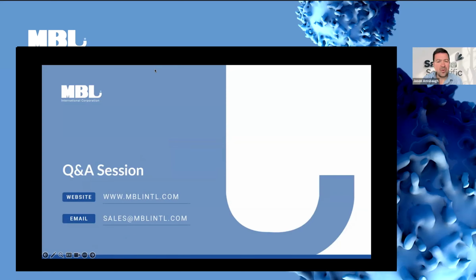Perfect. I've got one more question in the queue. Okay, audience members, if you guys have other questions, please ask them now. The question I have is, could this method be used to validate neoantigen in silico prediction tools? Absolutely. And for that, if all you care about is validating whether or not a peptide binds to a particular MHC, maybe don't get the tetramer. We have a monomer kit. We have a kit that's basically just the MHC molecule, and you can do that. You don't need to stain cells with it. It's going to be more cost effective to do it that way. Let's put it this way.